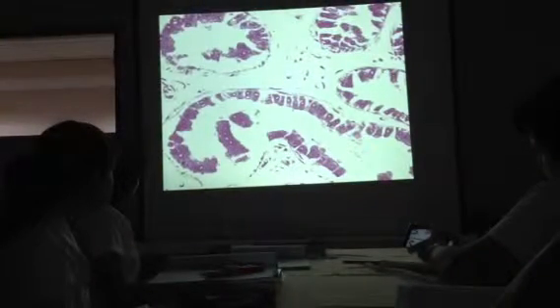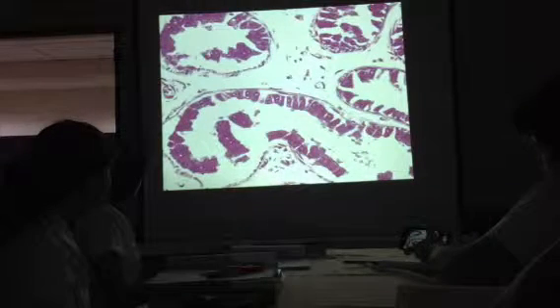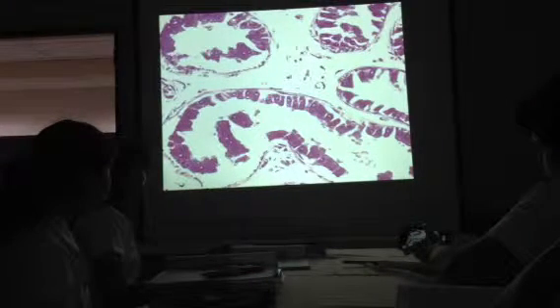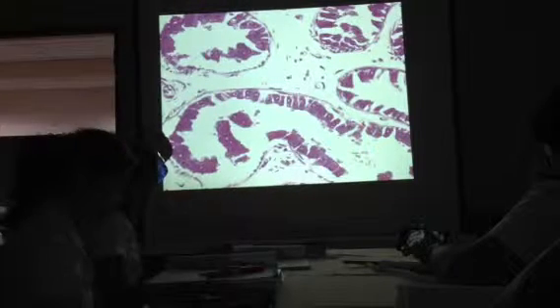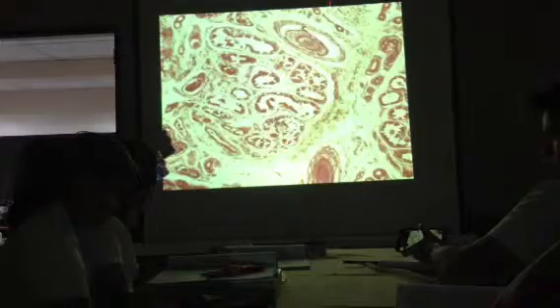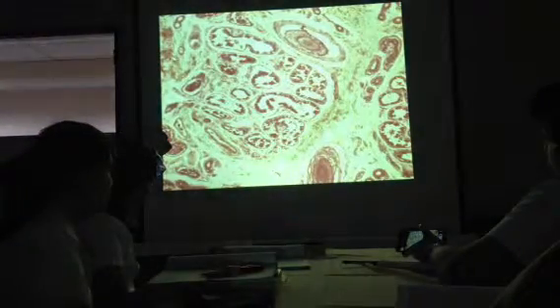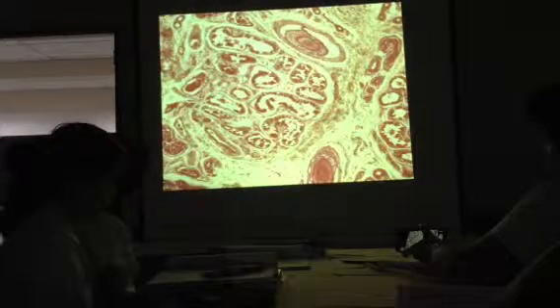Now that is the appearance of the epithelial cells of the apocrine sweat glands. What type of epithelium? The secretory portion is columnar, the ductal portion is cuboidal. Simple or stratified? Simple. Now, you will be able to say for sure that those are apocrine sweat glands because of the color of the cytoplasm. What color can you see?